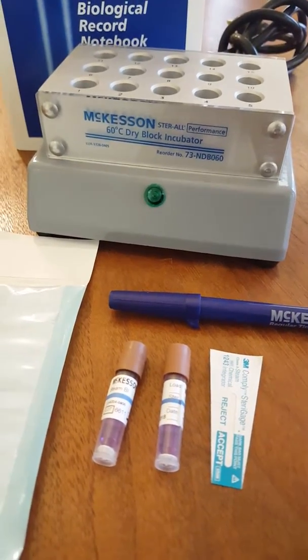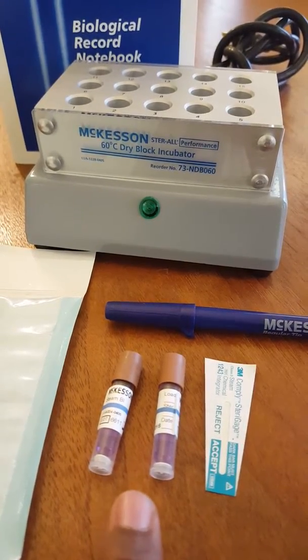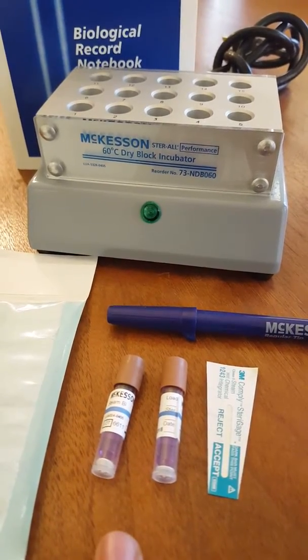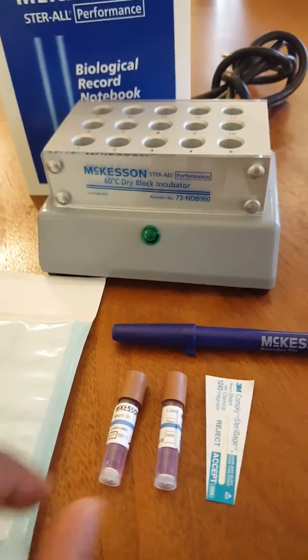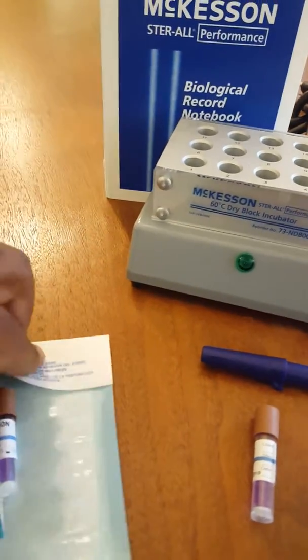So the first thing that we want to do is confirm that both of the lot numbers are the same on both of the BI indicators. And then we're going to put today's date, and then we're going to put our initials on it. Once that's done, we'll take the one that's going to be used for the test, place it inside of the bag along with the Class 5 integrator, and then we're going to seal it.